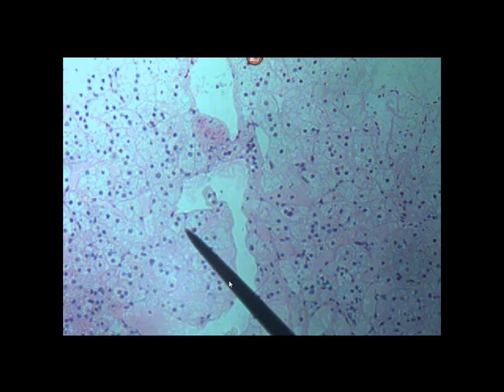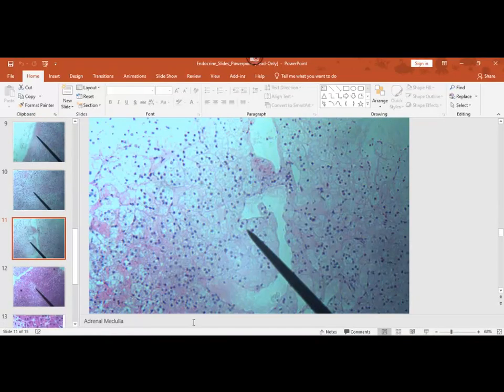And I can show you, we have some newer slides on the Padlet. We only have a few more of these. Trying to keep these videos short. There's nothing worse than clicking on a video and you see that it's an hour and a half long. So I debated breaking this one up, but I'm going to go ahead and finish this one. We have two slides left. We have the pineal gland and the pancreas. So I'm going to go back out.